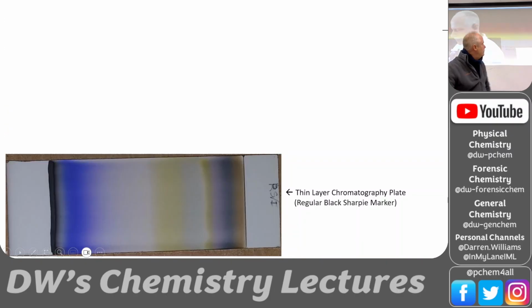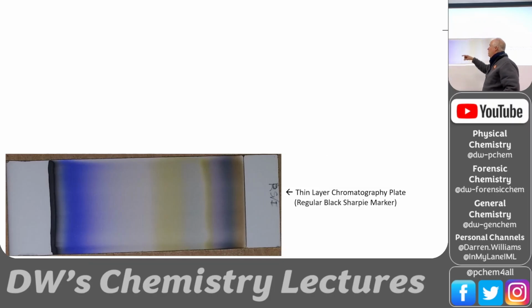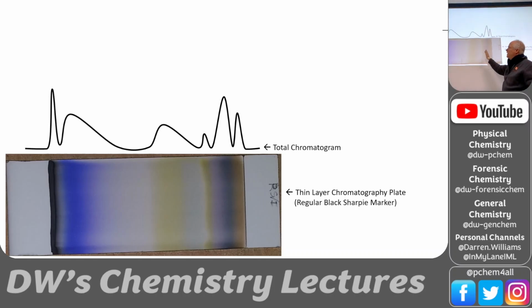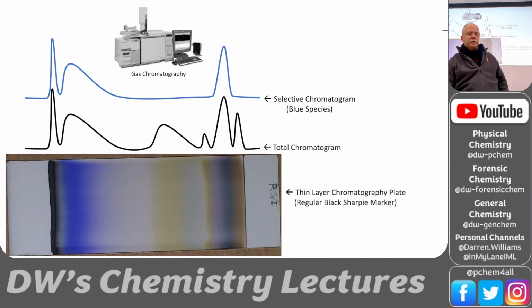Now this is interesting here. You can take this thin layer chromatography and see what we get in terms of data. So if you were to draw all of the peaks together and make a total chromatogram, you see a peak. If we were collecting data, if it was coming out the end of this column, we would see these different bumps in our signal with every peak, with every substance.